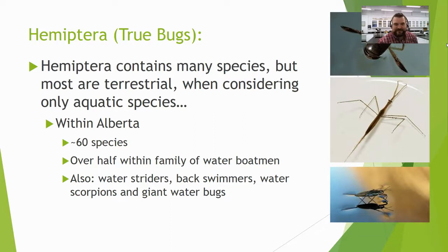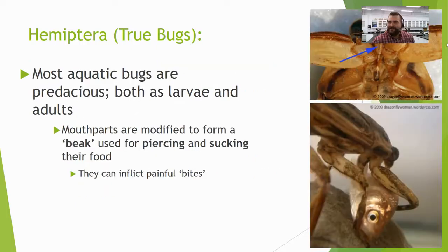And then also giant water bugs. We'll get a closer look at those today because I've grabbed some that we can throw under our lab camera. Giant water bugs. We sometimes commonly refer to them as toe biters. Okay, and here's a couple pictures of our giant water bug. Because they're so big and their feeding parts are so large, they're a great one to look at.